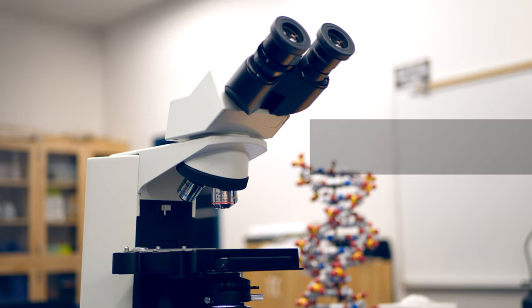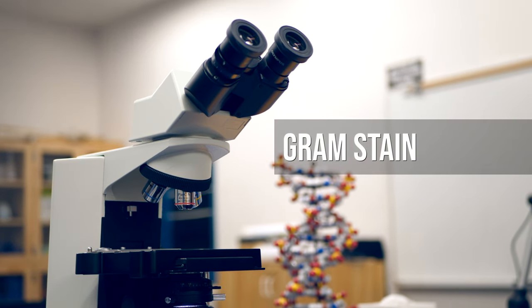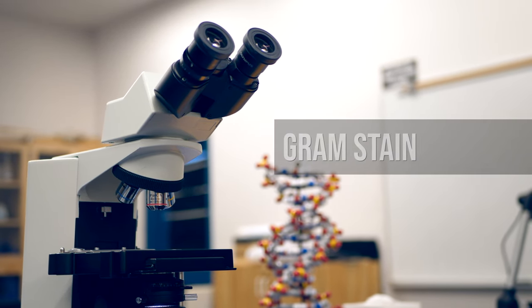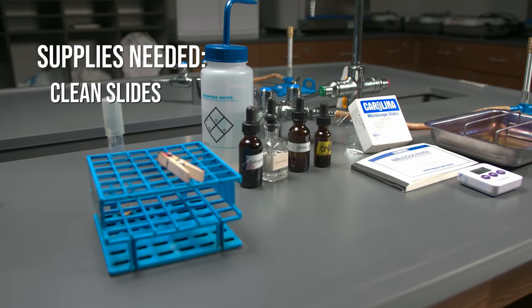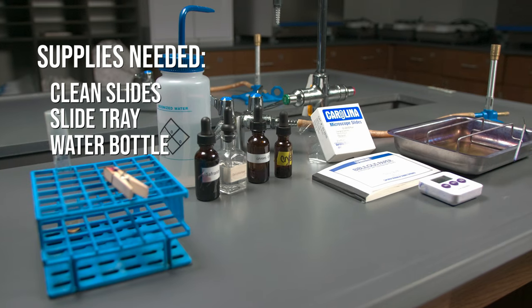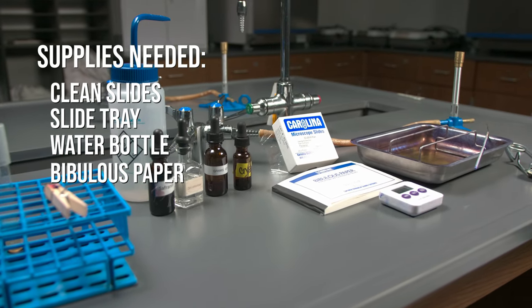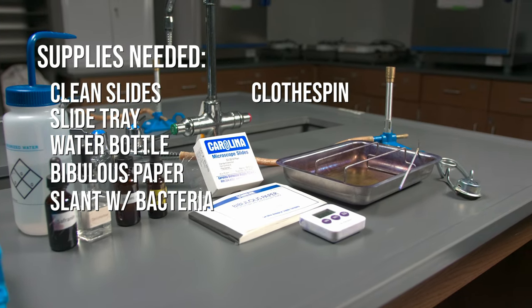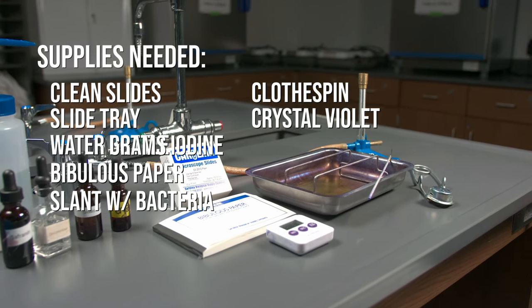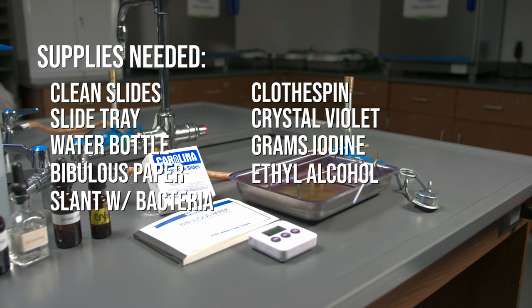In this video we will cover how to create a gram stain. The supplies you will need are clean slides, a slide tray, a water bottle, bibulous paper, a slant that contains bacteria, a clothespin, crystal violet, gram's iodine, ethyl alcohol, and safranin.